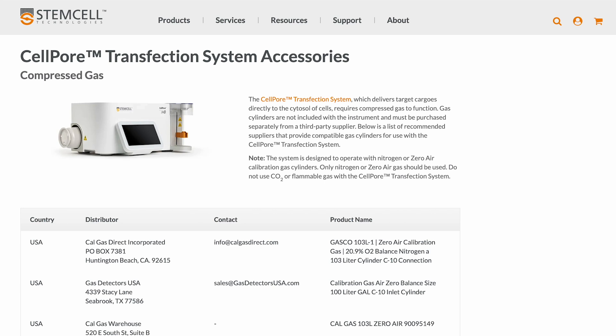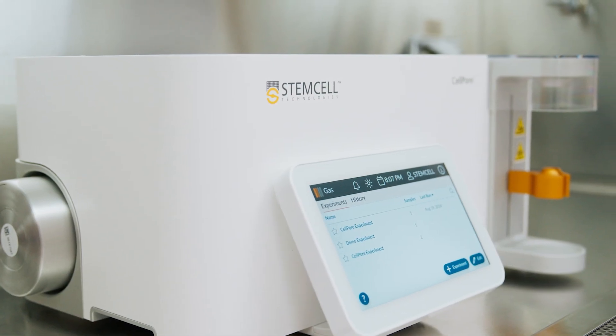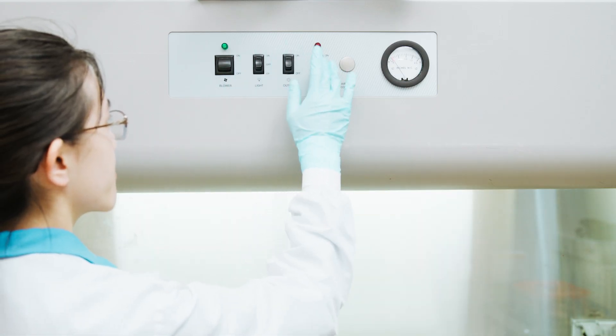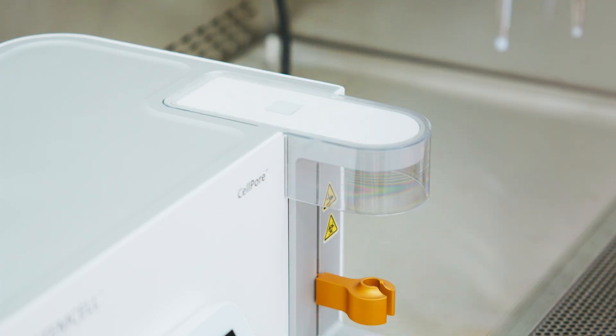Refer to CellPore.com for details on ordering compatible gas cylinders. For continuous operation, it is recommended to keep a spare nitrogen or zero-air compressed gas cylinder on hand. On the day of transfection, wipe down the CellPore instrument with 70% ethanol before placing it in a working biosafety cabinet. Install the safety shield that covers the nozzle. Proper installation of this safety device is required for operation.